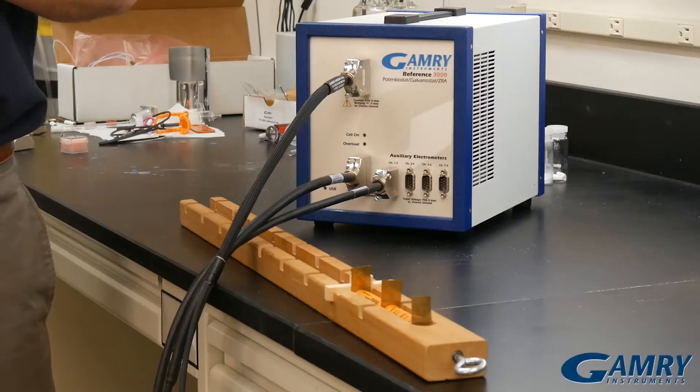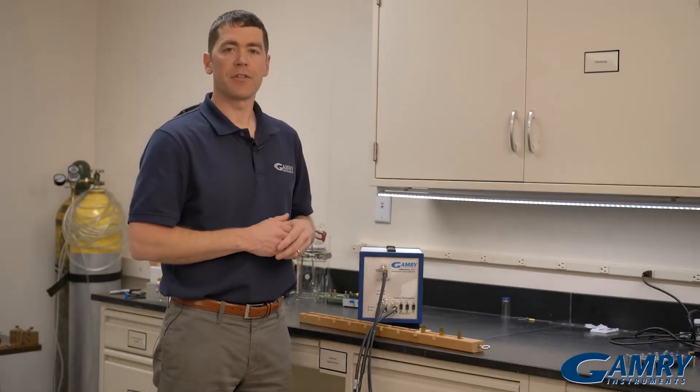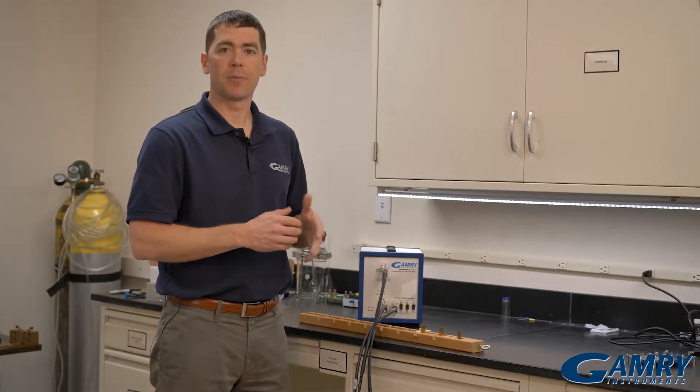Hi, I'm Chris Beasley with Gamry Instruments. In this video I'm going to show you how to use the auxiliary electrometer in the Gamry Reference 3000 potentiostat. I have two 18650s lined up in series here, and I'm going to connect the potentiostat up to both of them and characterize them simultaneously in an experiment.